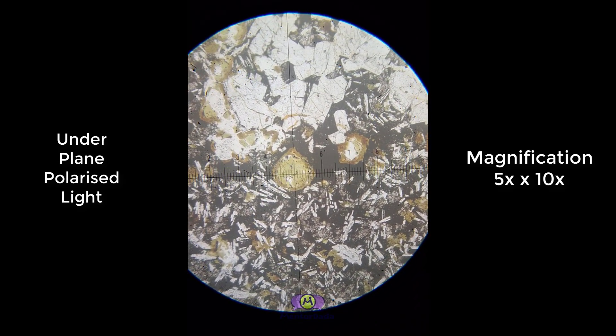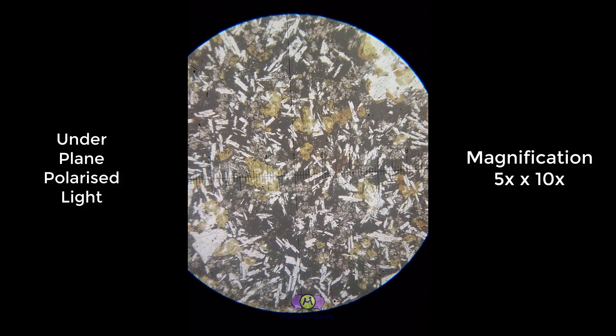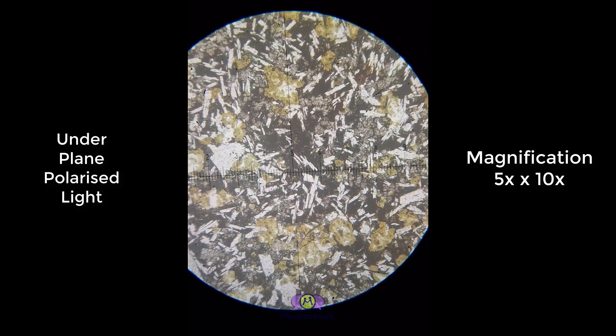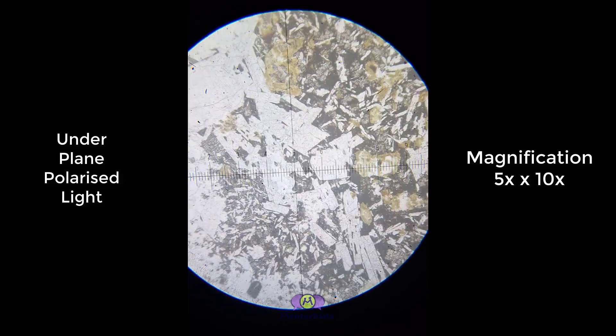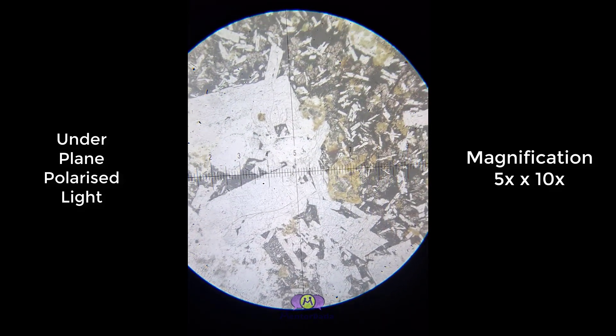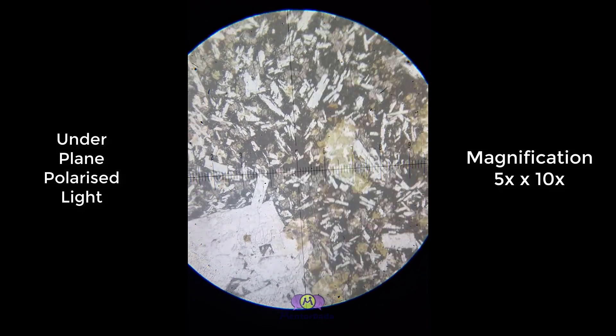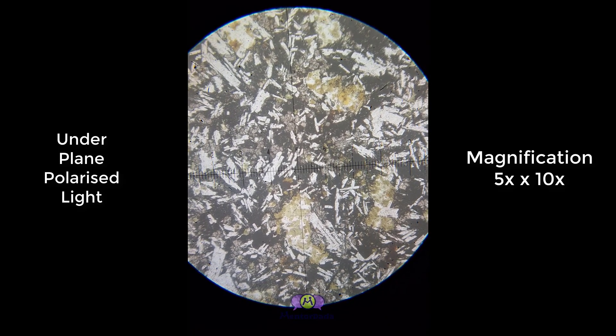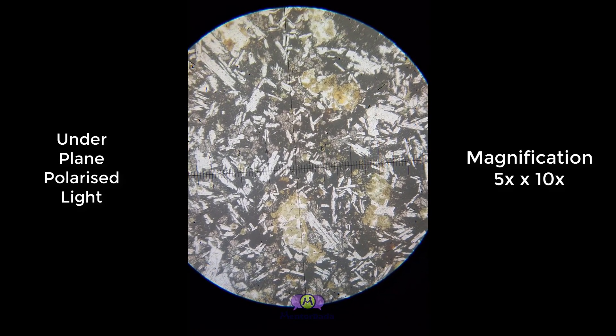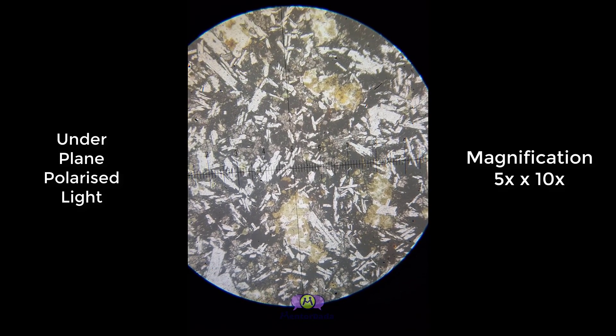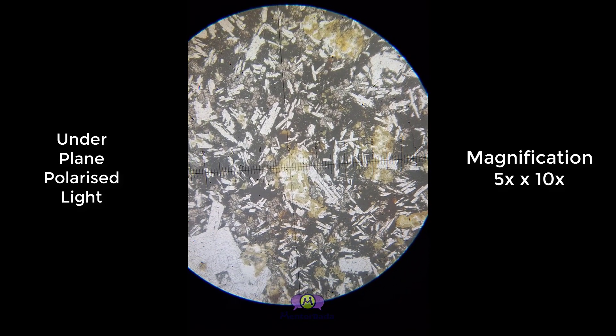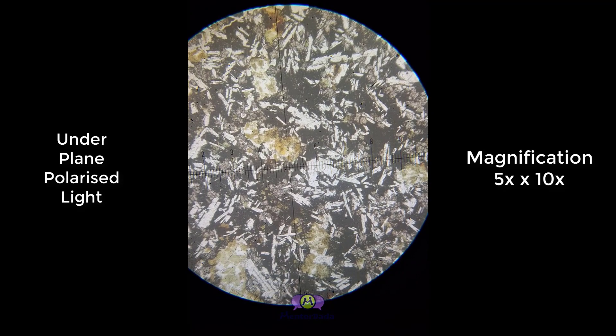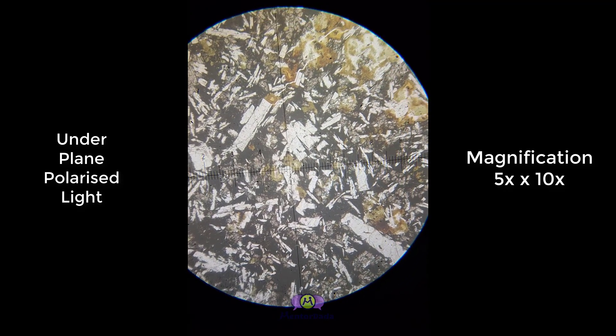The patches are mainly glassy material. Lots of plagioclase laths are also there, which are white colored and characterized by low refractive index. These black colored materials or opaque minerals are mostly magnetite, and the greenish patches are glassy material. Now we will observe this thin section under cross-polarized light.